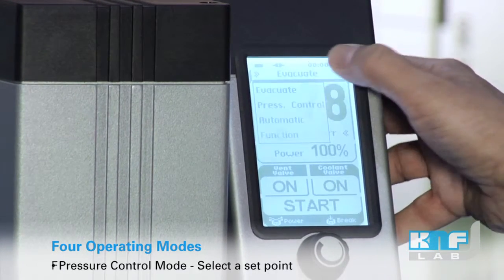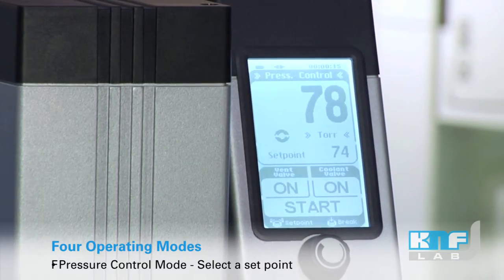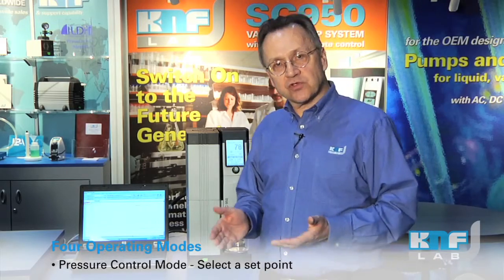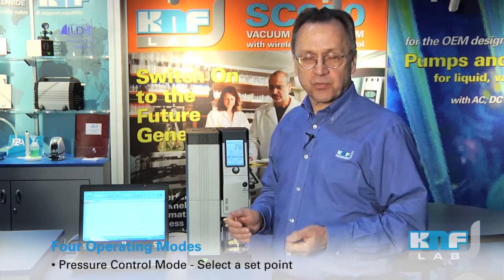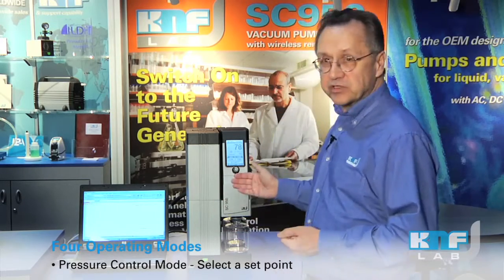Another mode is the pressure control mode. Now you know the solvent you're working with, you know the boiling point — simply set the set point for the vacuum and we will pull down accordingly.